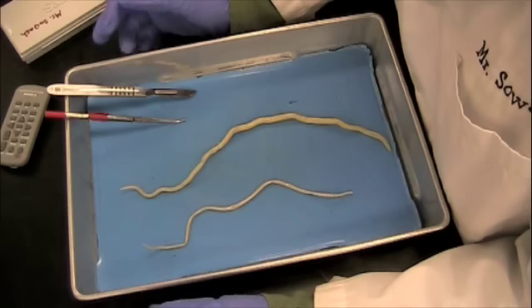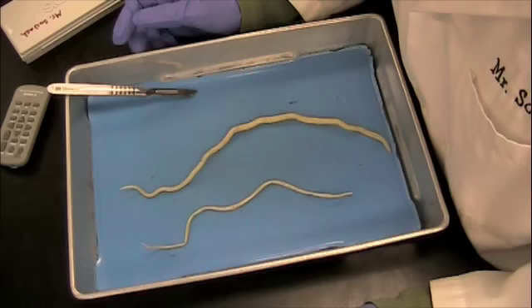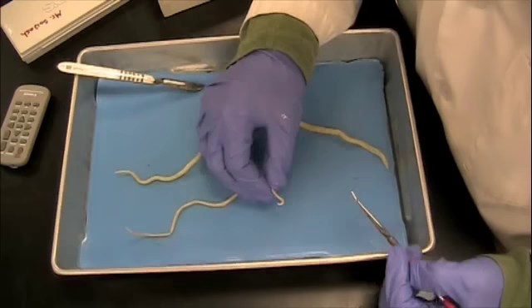You can see that this one here is much larger than this one over here. The most telling characteristic however is that the males have a hooked posterior end. This one right here you can see has a hook on the end and this is a reproductive feature.